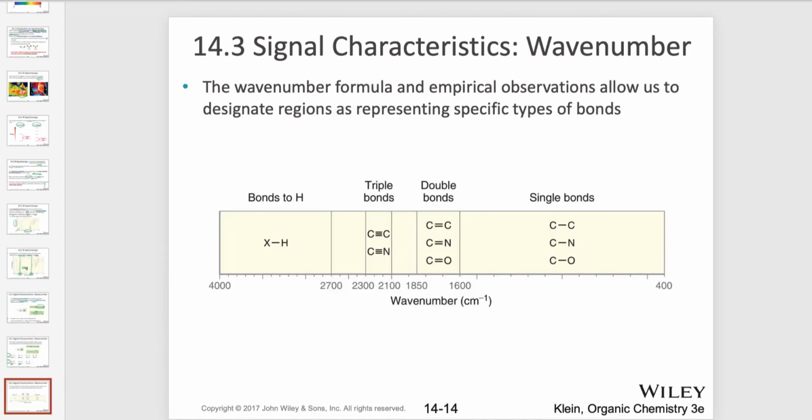So here's one very helpful tool in your textbook. We're basically comparing single bonds, double bonds, and triple bonds, and seeing how they are all between the same atoms.